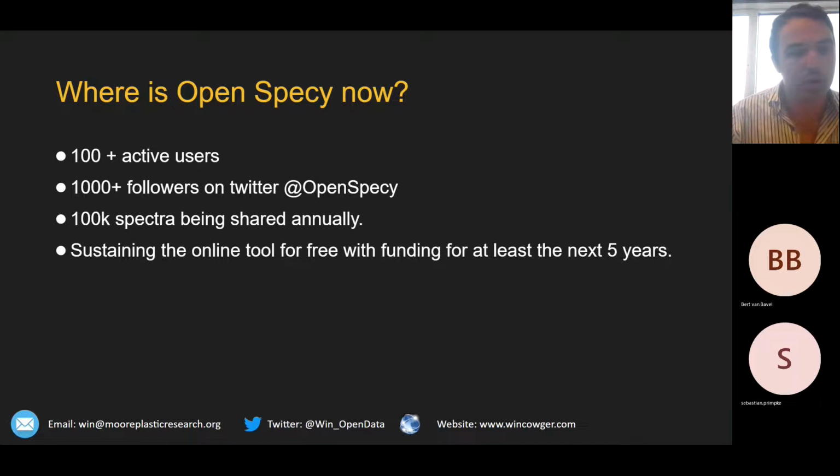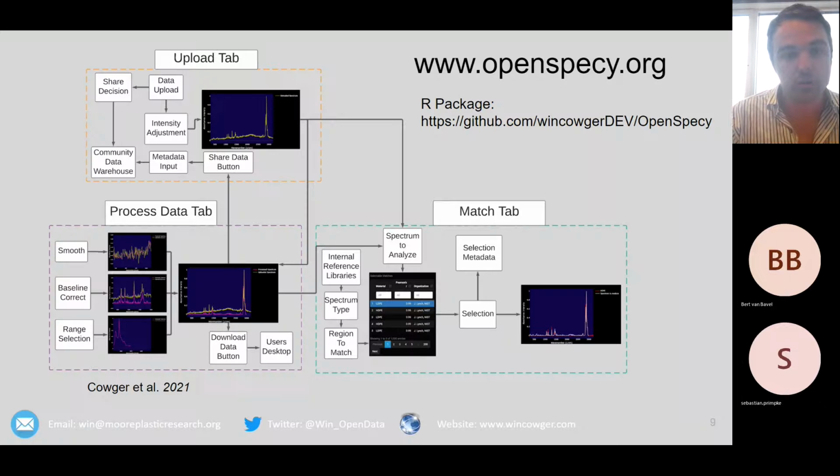So we're in pretty good shape, and these stats, I had to update them. It's like doubled since the last time I gave this presentation a year ago. So this community is really rapidly growing. It's really exciting times. The tool currently is hosted at openspecy.org.